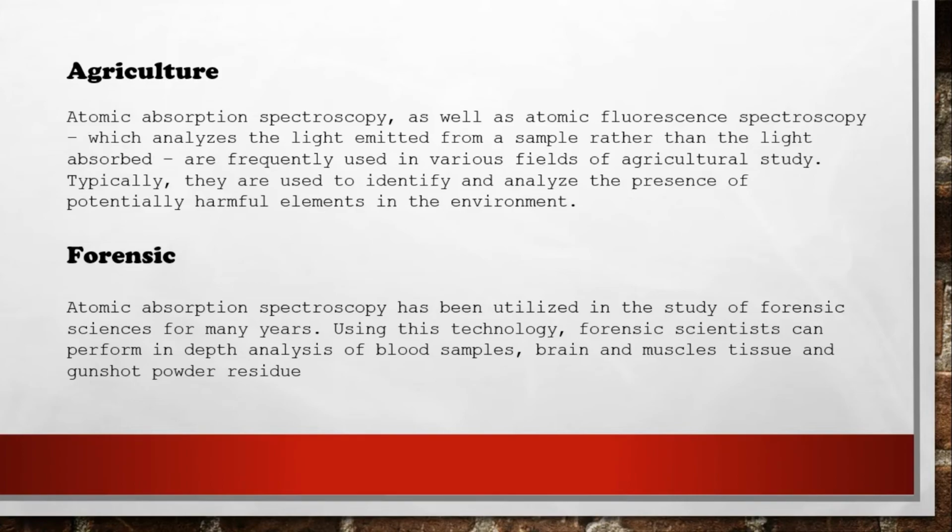The last one is forensic. Atomic absorption spectroscopy has been utilized in the study of forensic sciences for many years. Using this technology, forensic scientists can perform in-depth analysis of blood samples, brain and muscle tissue, and gunshot powder residue.